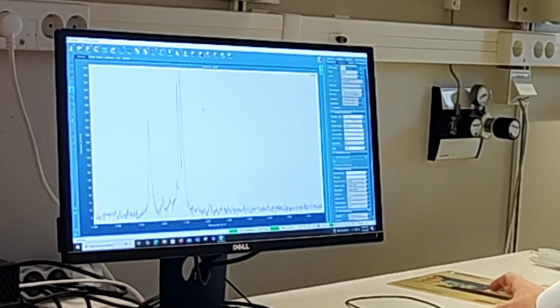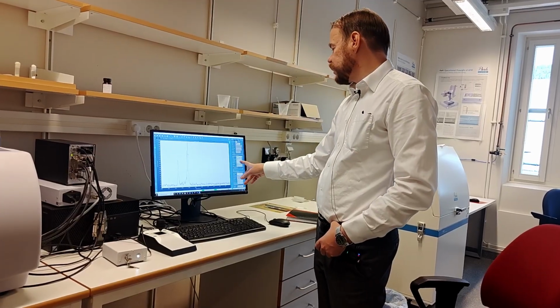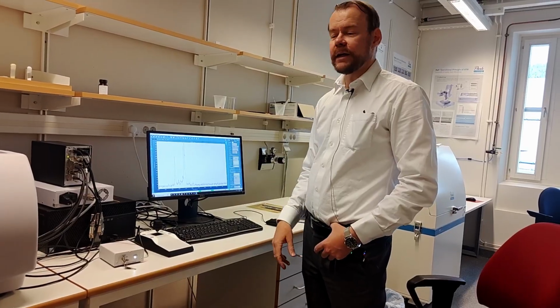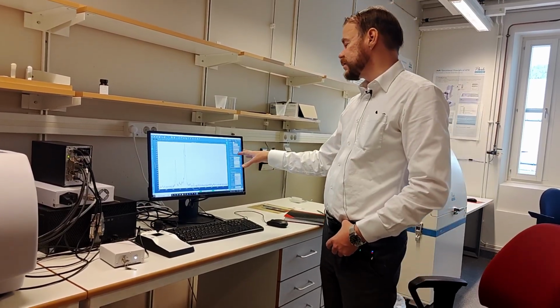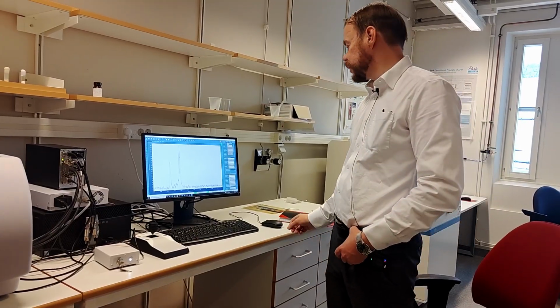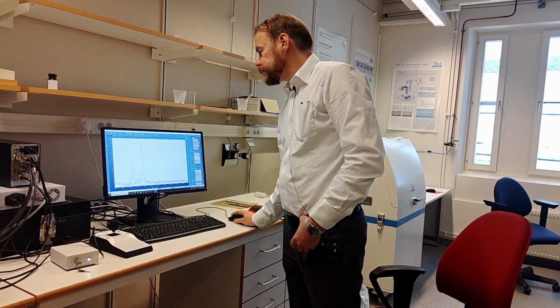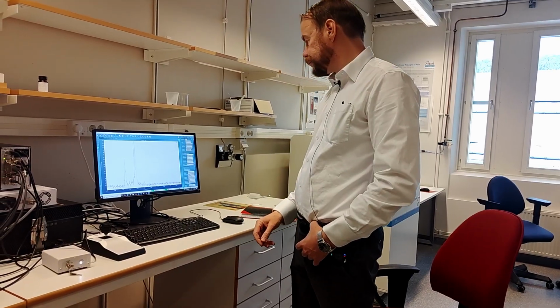So let's say that this is fine. You have about 400 counts still on this part of the spectrum. I guess that's also a similar intensity. There wasn't so big a change between these objectives really right now, at least. So let's go back to the camera.